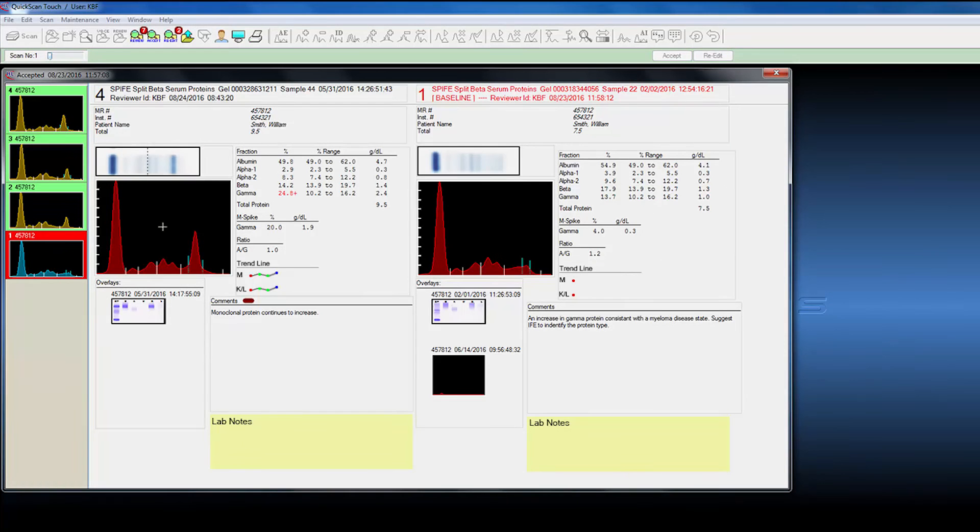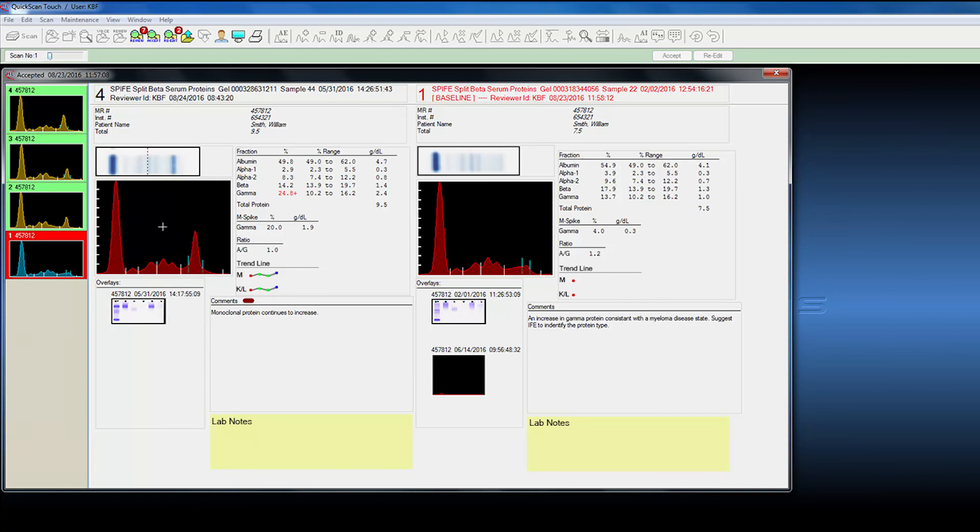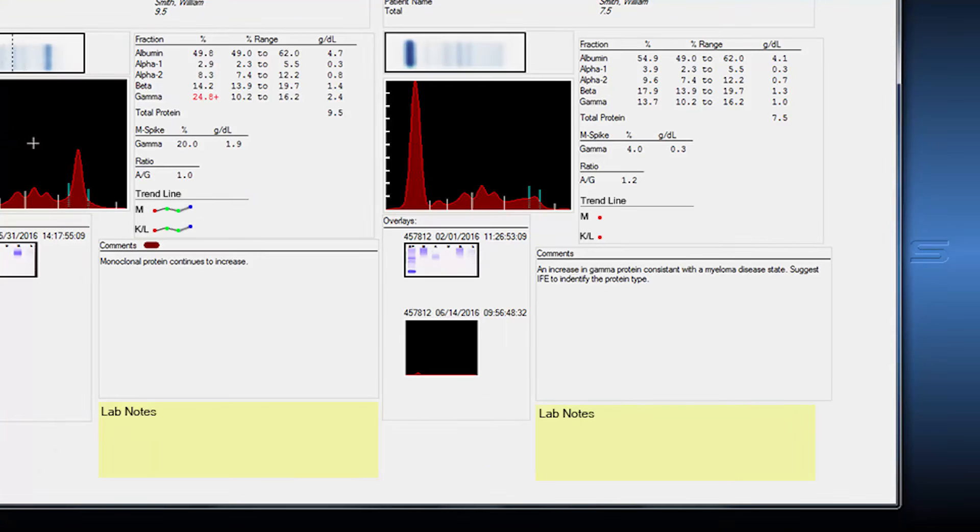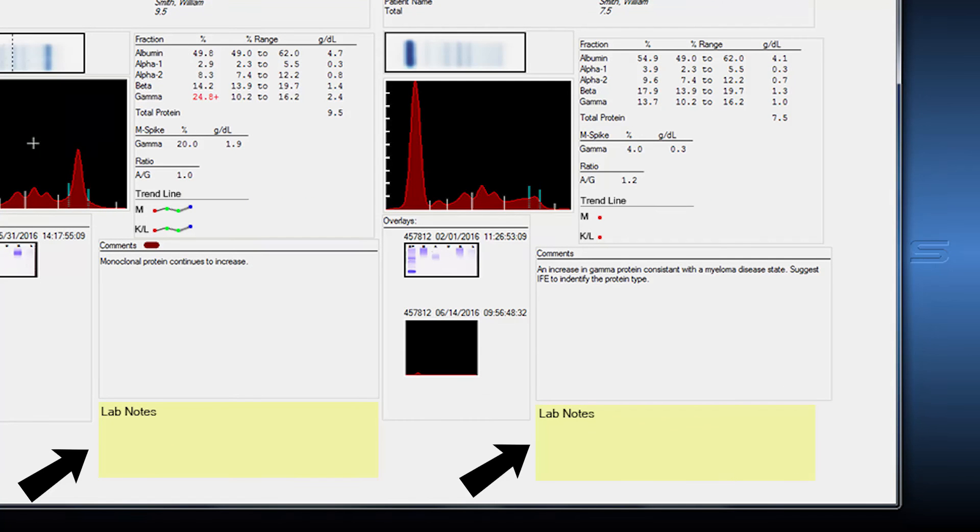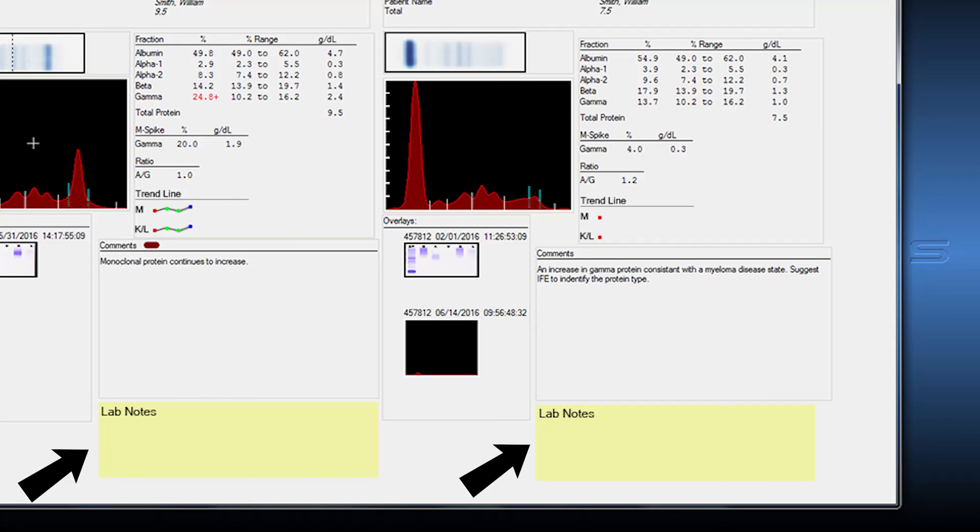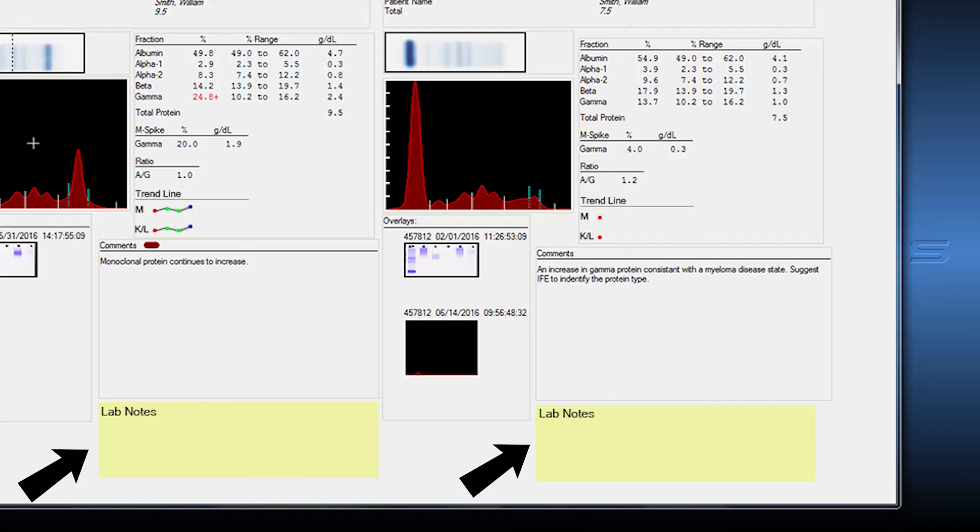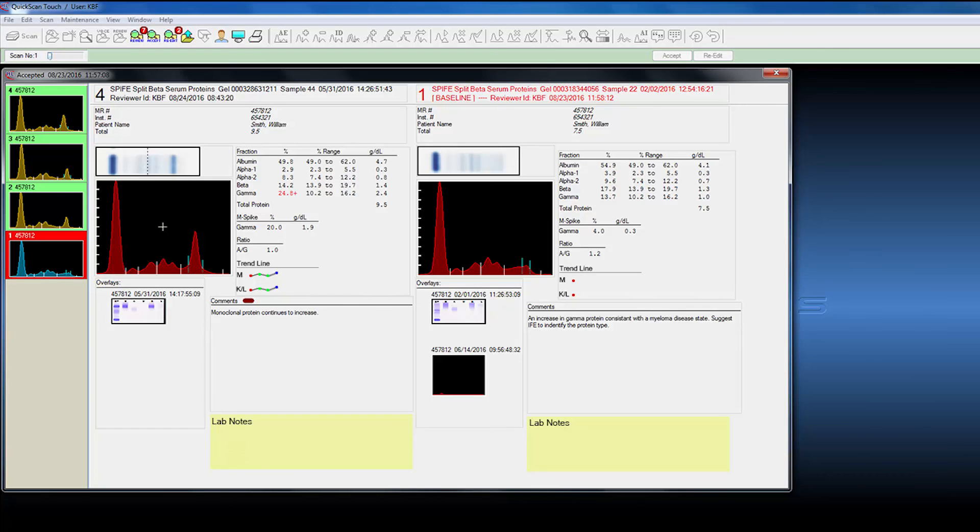One other item we're going to add is a post-it note, if you will. It's an interlab note. It's probably going to go in a text box right here. And it's simply communication notes that the pathologist may leave for the medical technologist or the technologist may leave for the pathologist. Just something that's going on with this patient that they might want the pathologist to know.